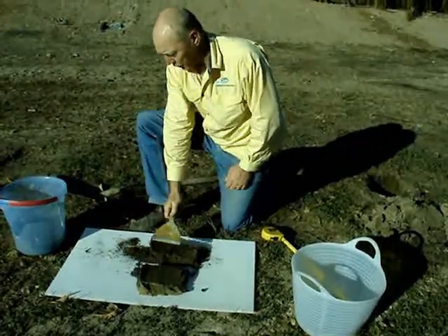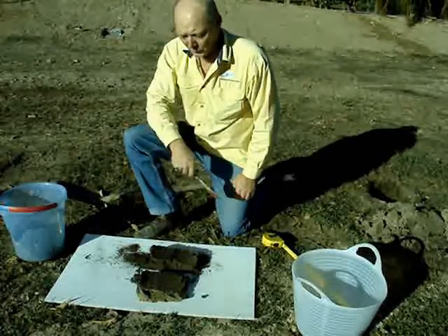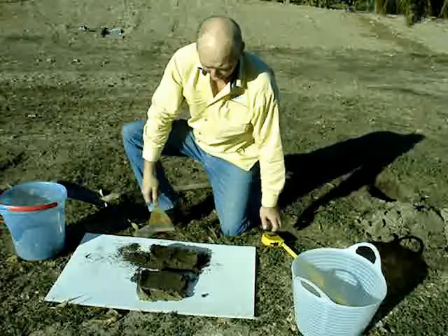These two cores: the top core will go into one bucket, which will be your topsoil bucket, and the bottom core will go into your subsoil bucket.